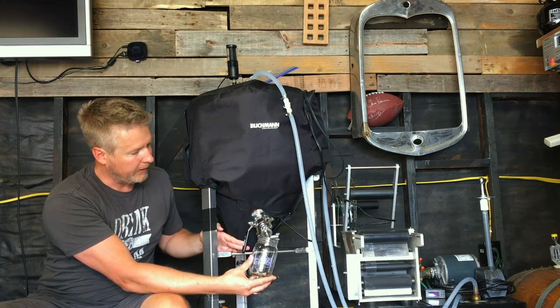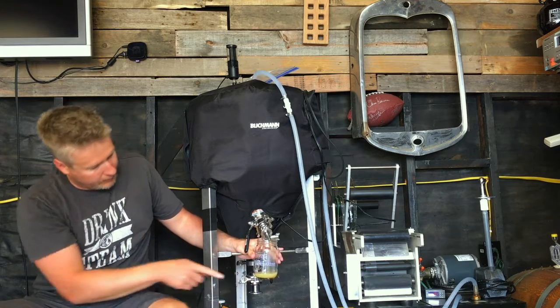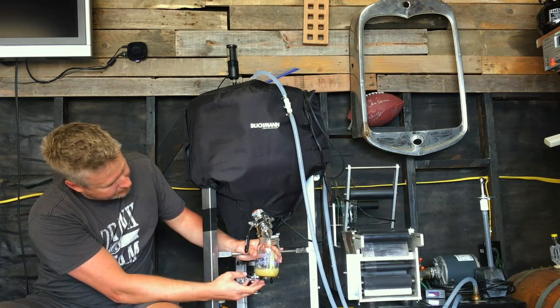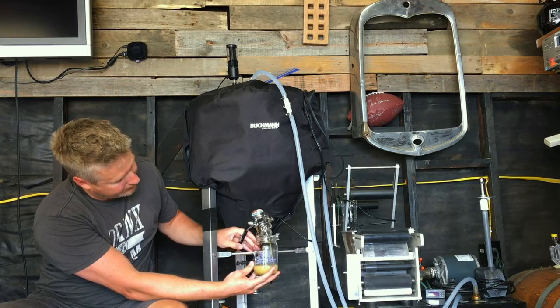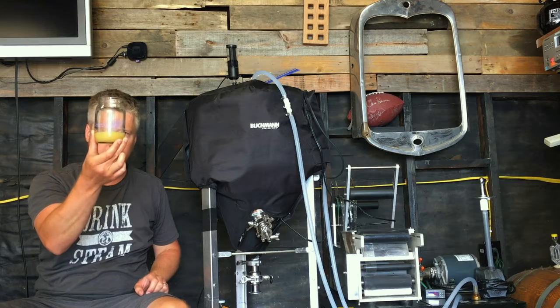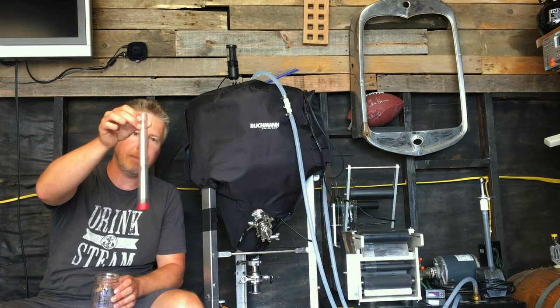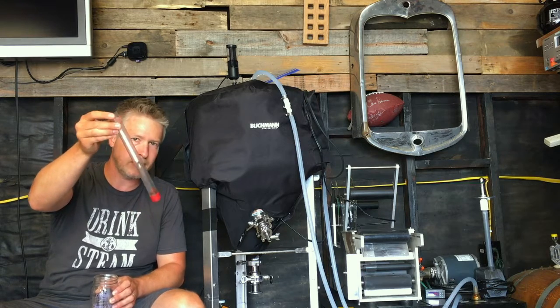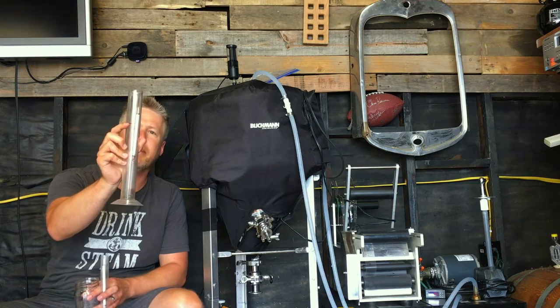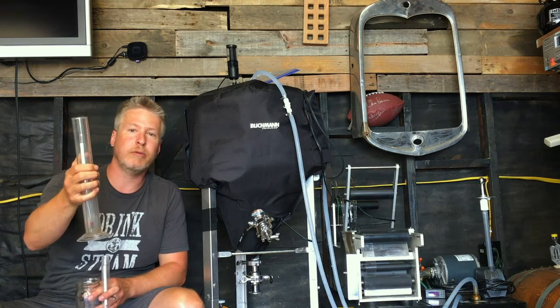And now, when I said volume, you're looking at maybe 100 milliliters somewhere in there. So we're going to kind of just go just up to the bottom of here. See, we're pulling off the bottom here. There we go. So that's about all you really need. And the reason being is your hydrometer tube, I prefer to use this little shipping container just so it's less volume. If you do use the larger style, go ahead and make a mark of what that minimum volume should be. And the reason being is you don't want to overshoot or undershoot.